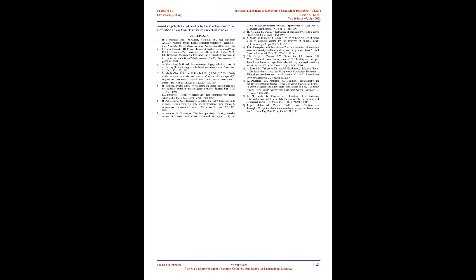The optimized system for the removal of Pb(2) ions by extraction showed high precision, efficiency, and selectivity, which led to successful application on river sediment samples. Results showed that the optimized system is effectively applicable to 3 of the 4 analyzed samples, Bokovici, Debitac, and Berkovica, with an efficiency of over 94% removed Pb(2) ions, and with an efficiency of only 50% for 1 sample, Suljagic.